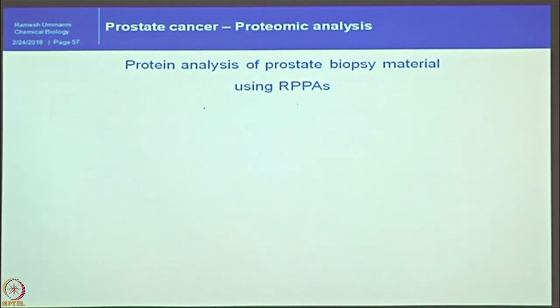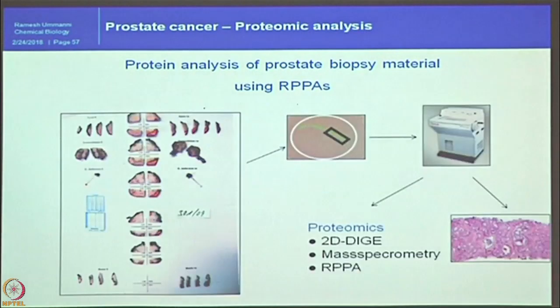Now, in the last couple of slides I will sum up. Protein analysis of prostate biopsy material using the RPPA approach. I said in the beginning that any type of sample can be analyzed here. So the capacity is high throughput, showing the applicability of RPPA towards the biomarker discovery approach.